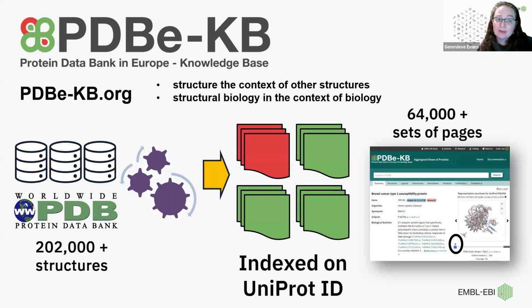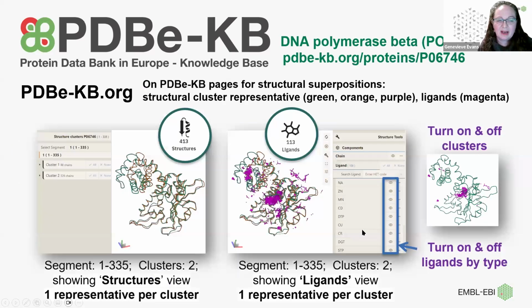So if there's a protein, in this case, we've got BRCA1. It is a particular gene product in human proteins that corresponds to a particular protein sequence. And we map every structure that corresponds to this to that particular UniProt ID, and then we can generate a page. And in this case, because there are some structures determined at the N terminus, some at the C terminus, you then have a page that shows both the C terminus and N terminus structures on one page. And that can be helpful.